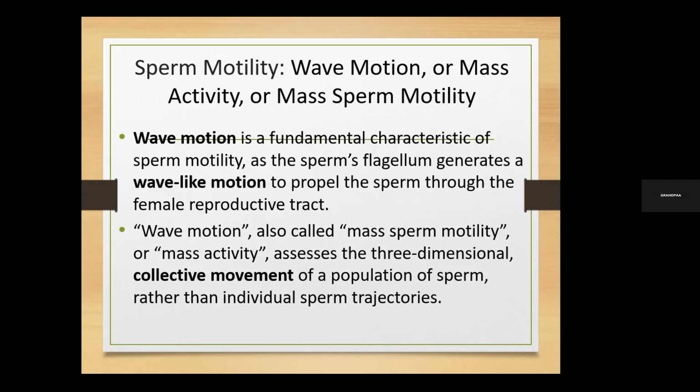If the waves that you are seeing are very intense, what does it tell you? You're also seeing some waves somewhere which are not very intense. What does it tell you? There are a lot of fish there.